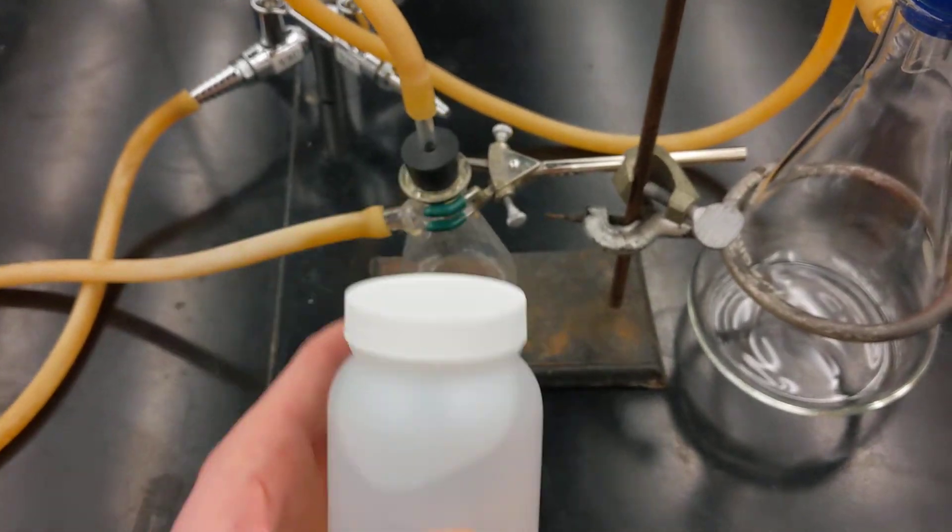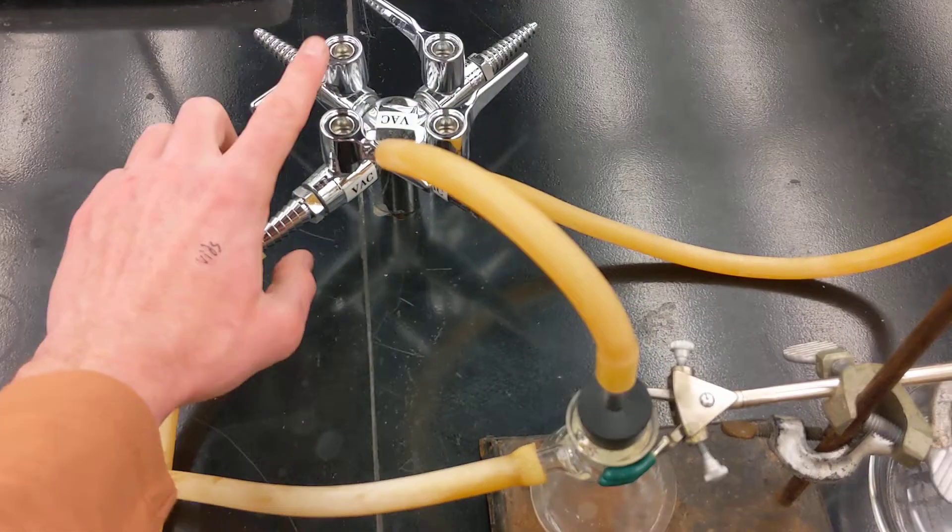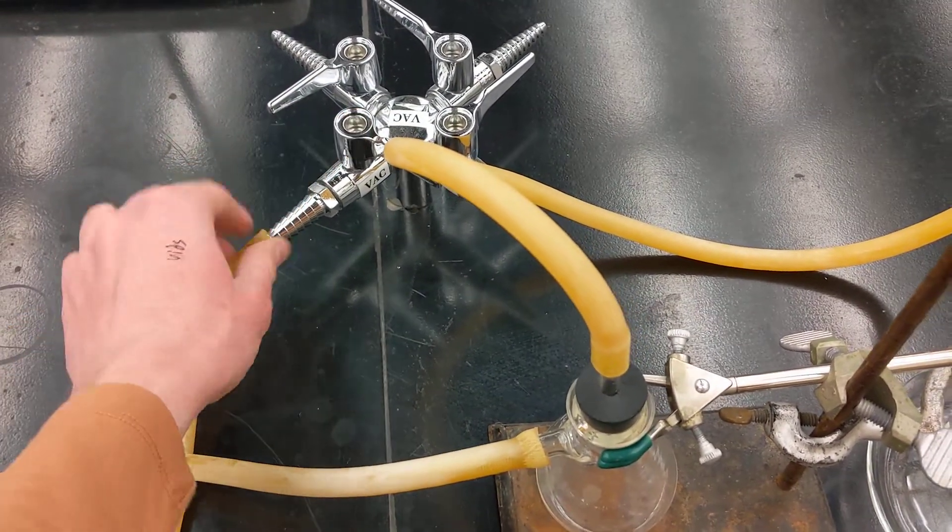This is a 250 ml bottle. You're going to use a setup that looks like this. This is a vacuum filtration setup. We're using the house vacuum here, but you could also use a portable pump.